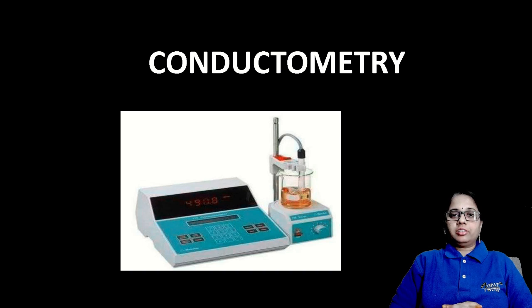In today's session, we are going to learn about conductometric titrations. In titrations, we have seen so many types of techniques. One type of titration is conductometric titration.